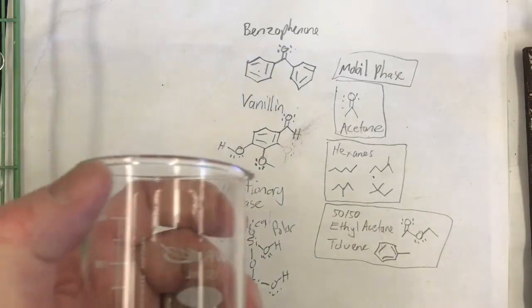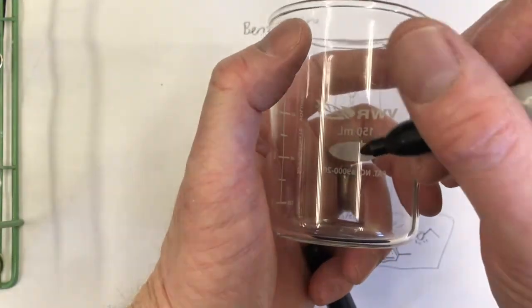And then at the far end of the TLC plate, you can see the last sample that was pushed to the top. That shouldn't interfere because I'm going to run my eluent, and it'll stop before the previous samples at the top. Sorry, I turned off the video. So let's do it. The first eluent I'll check is the hexanes.